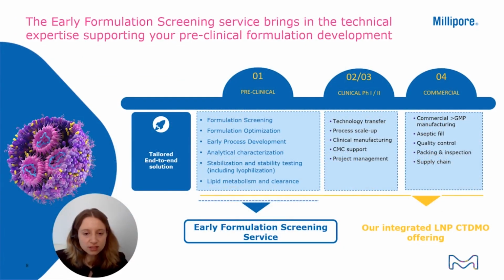Next, I would like to focus a little bit more on where our focus is. So we operate completely in the preclinical space. And as I initially described, it's our ambition to design customized lipid nanoparticles for a certain application. So how are we doing that? As I described in my introduction, the ionizable lipid is really the most important compound within the LNP formulation. So we have access to libraries of novel ionizable lipids.